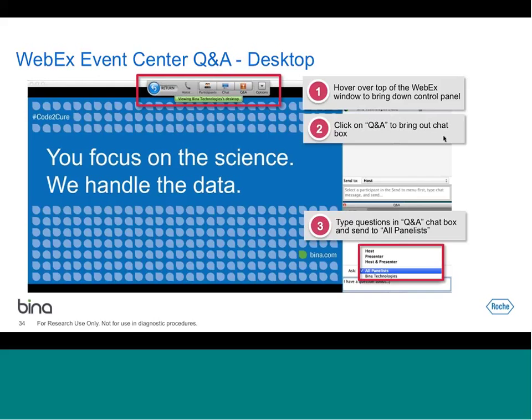All right, another question. Is the sample coverage critical to detect the variants using SomaticSeq? What's the minimum coverage for either whole genome sequencing or whole exome sequencing? That depends on how the tools are designed, if the tools can detect mutations at this coverage.